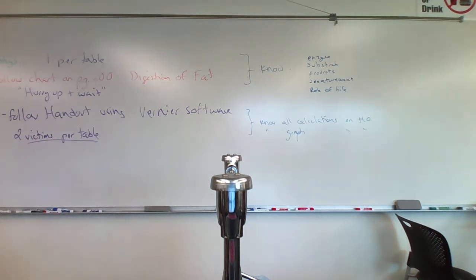The 0 ones, I should have brought it in this morning. Here it is. At 0, you just put them in the ice tray. And you'll notice that 4B and 5B have something other than drops in them. What's the third component of those ones? Bile salt, which we'll talk about today in lecture, but we have very smelly bile salts. This will make you throw up if you really smell them. But how much bile salt are you putting in there? A pinch. Like in cooking, you know a pinch when you do a pinch, right?